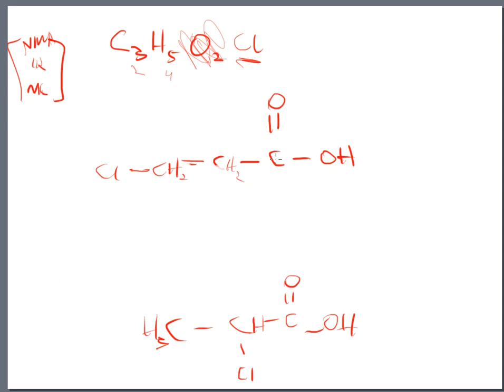For this particular carbon, there are no protons assigned to that carbon, so there's no signal from it at all. The same goes for the signal down here at the bottom. There are no protons on that carbon, and because of that, there's no signal from that carbon. Now let's look at option number 1. Next door to that, I see a signal, and next door to that, I see a signal there as well. So I'm going to see 2 major signals showing up in this particular compound.